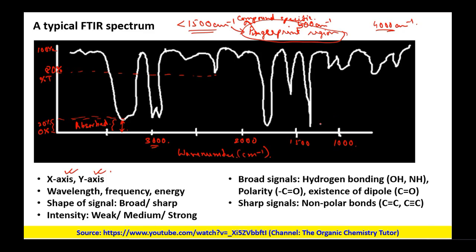While doing the analysis, we need to understand that we will be working in the region of wave number greater than 1500. Sorry, I am not able to draw the line straight.